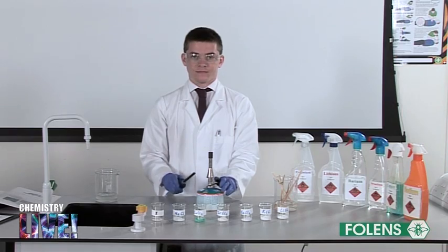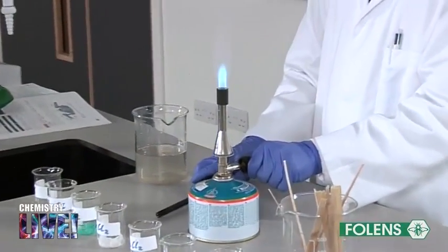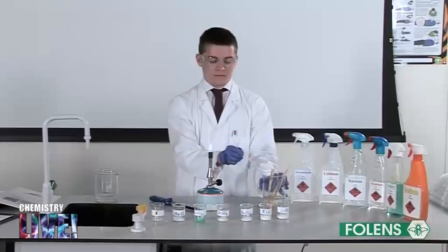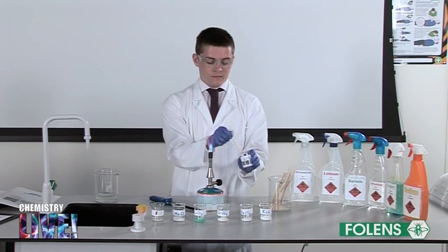Light the Bunsen burner and adjust it to get a blue flame. We use wooden splints that have been soaked in water to hold the salt in the flame of the Bunsen burner. Dip the wooden splint in the lithium salt.